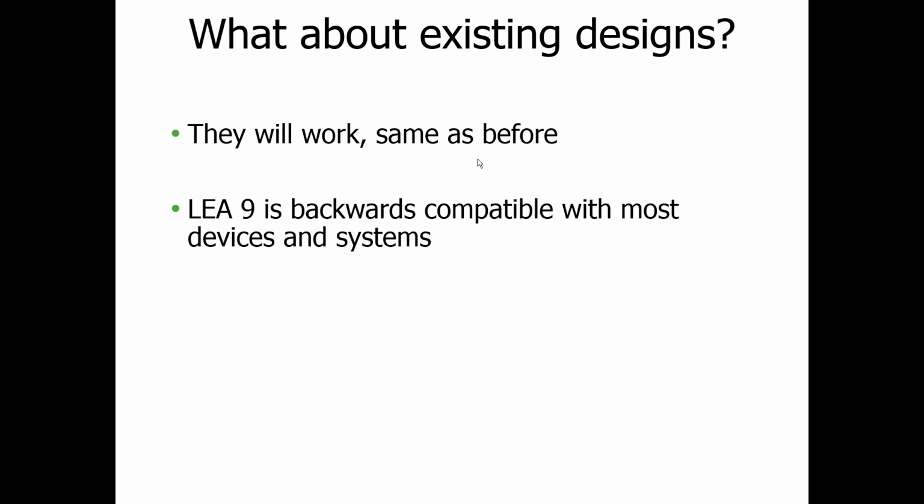I did mention earlier that not every device has LEA 9 compatibility. If you have existing designs that run through LEA 9, they will still run through LEA 9. If that device is not compatible for some reason, we will let you know. And what that essentially means is that you cannot create new designs through Design Creator for those particular cases. But the vast majority of devices are currently in LEA 9 and currently compatible with Design Creator itself.